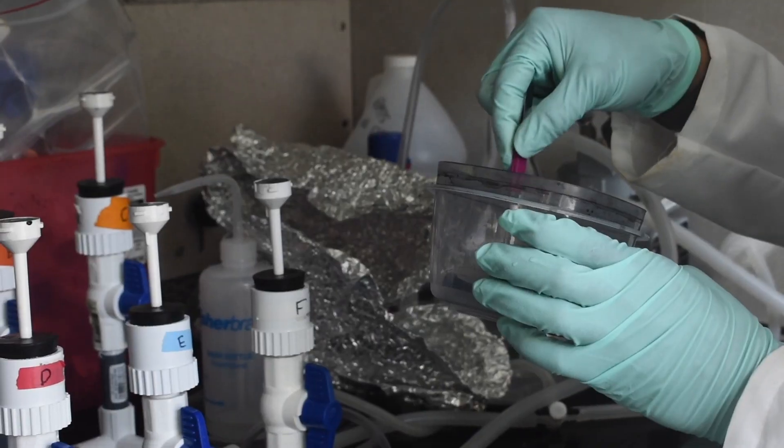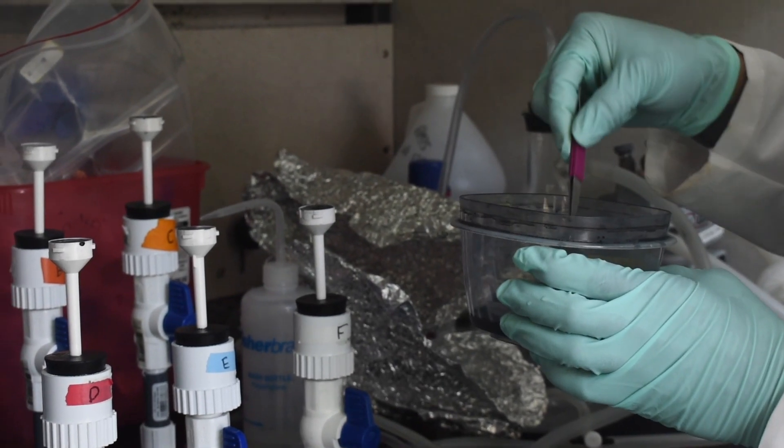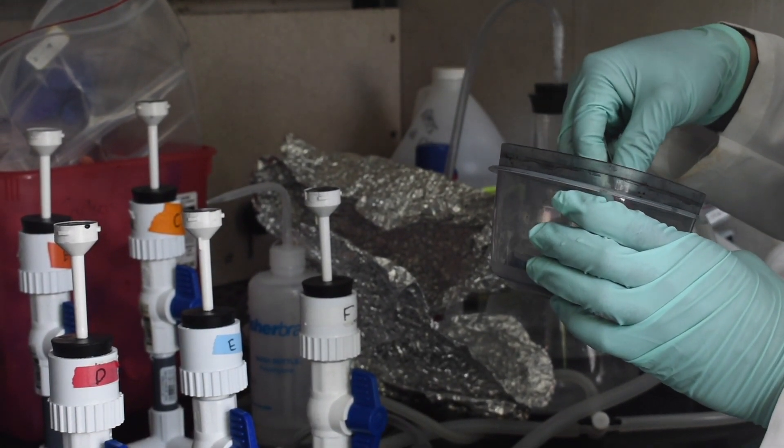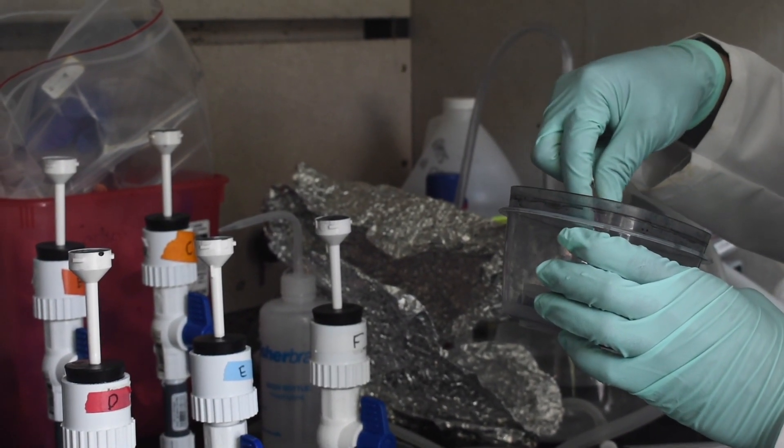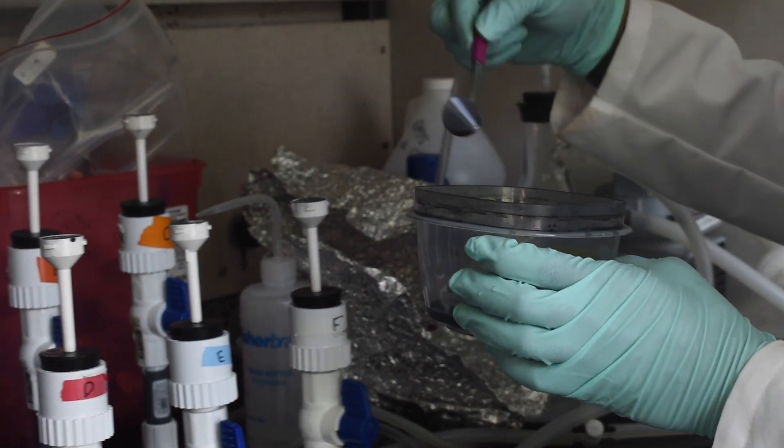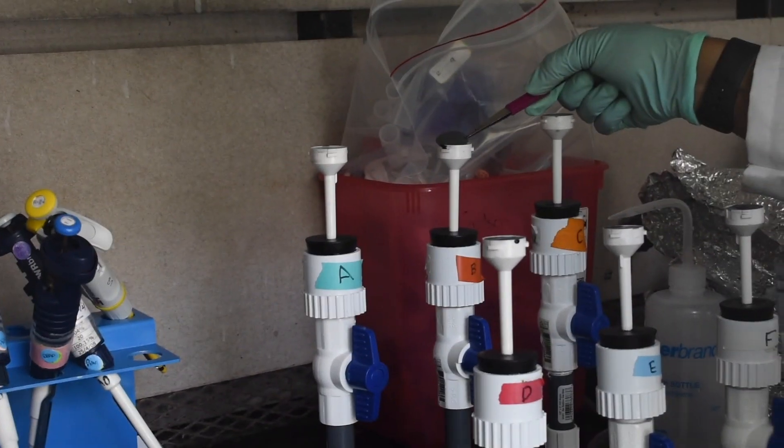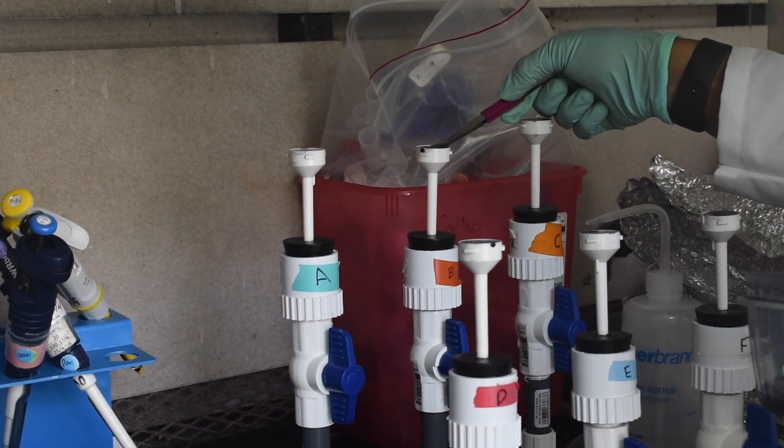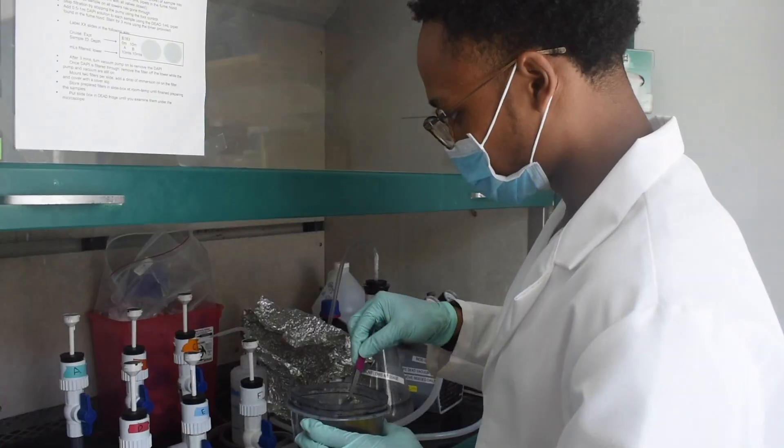In order to see the bacteria on the microscope we need to first stain the filter with a carpet stain called Irgalan Black and we stain for about 15 minutes to overnight to make it kind of this gray color and then we can use the filter.